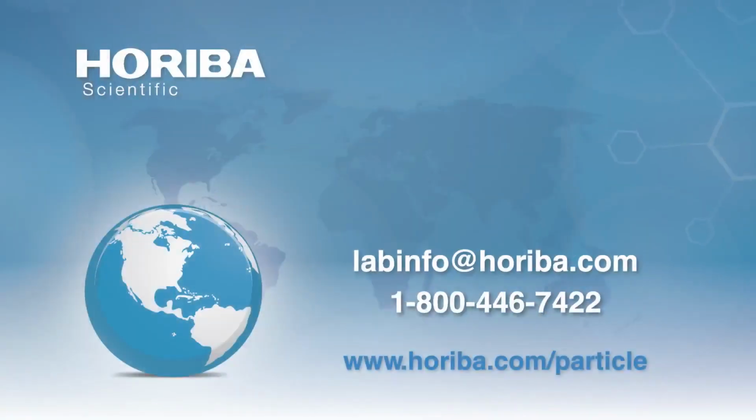Well, thank you so much, David, for the excellent webinar. I found that it was super interesting, especially the very last example. We've also measured mayonnaise, something a little bit on the similar side, and we found that, hey, in the range of 10 micron is when people perceived it as yummy, high quality. And so in addition to zeta potential, I think size is also super important.